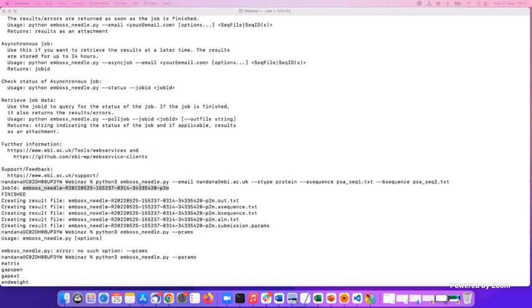Thank you. And the other question is, what are the advantages of using scripts over click and get interfaces that look difficult to a common user? Okay, so this is mainly used when you have so many alignments.